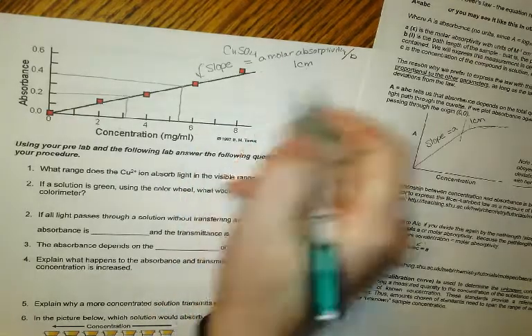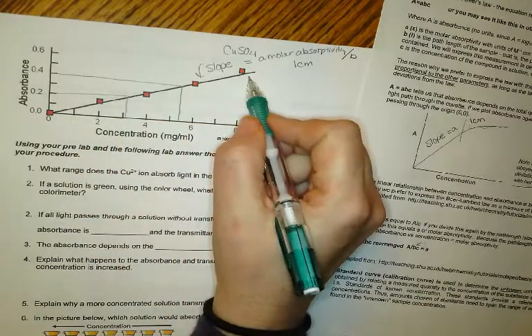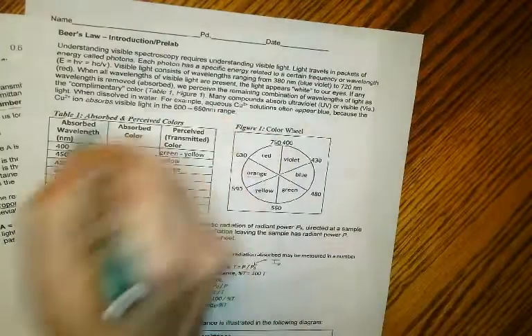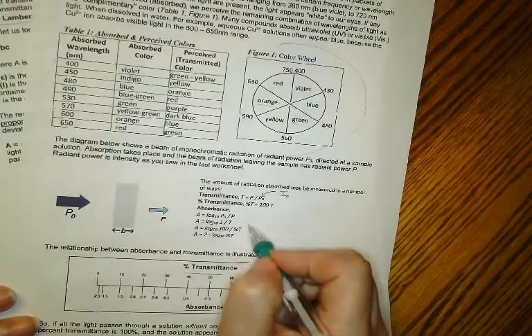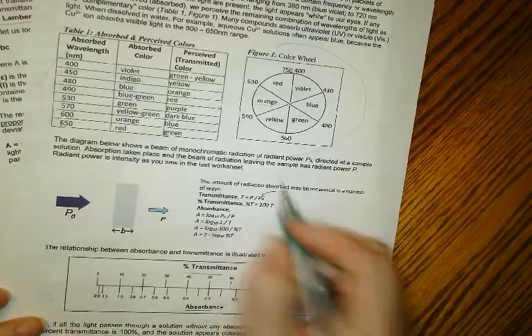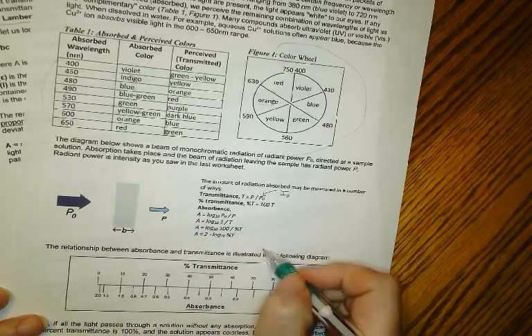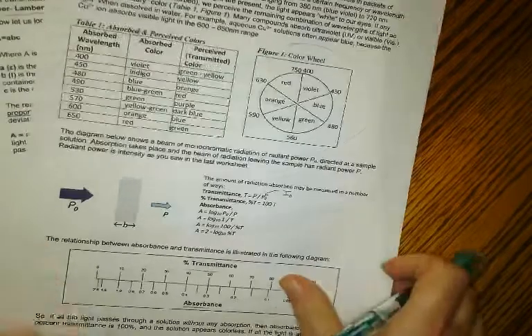So that's something that they might test you on, is to find your unknown from a standard curve, okay? They also might ask you some questions about some information on the path length and what wavelength you want to check. These are not on your list, so unless they give you these formulas in a question, it probably won't be on there. And you also need to understand that if I have 100% transmittance, I have no absorption. As my absorption increases, my transmittance goes down.